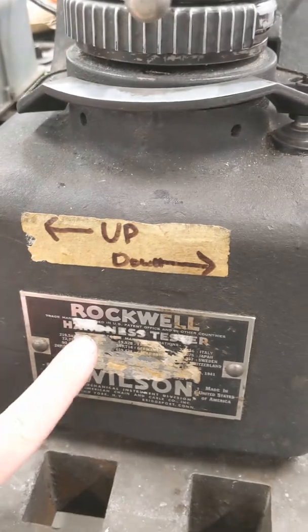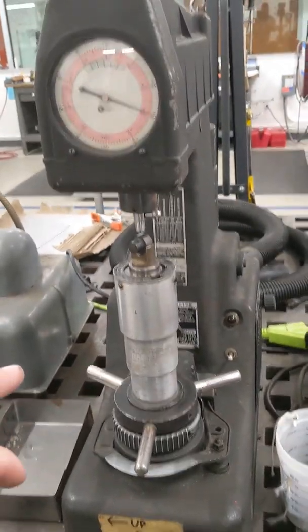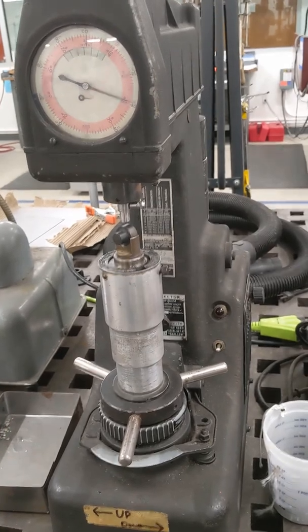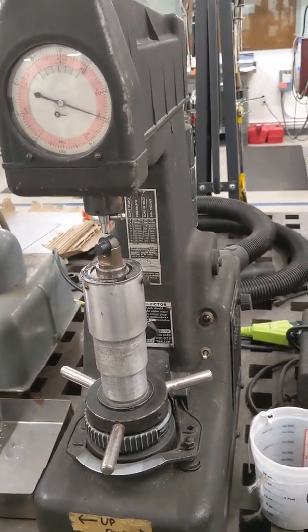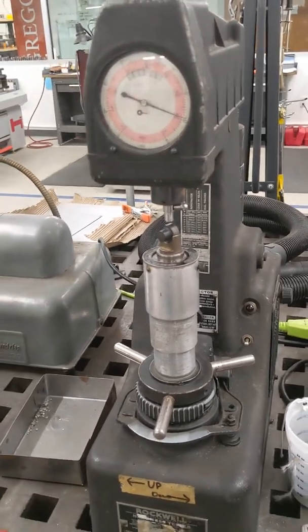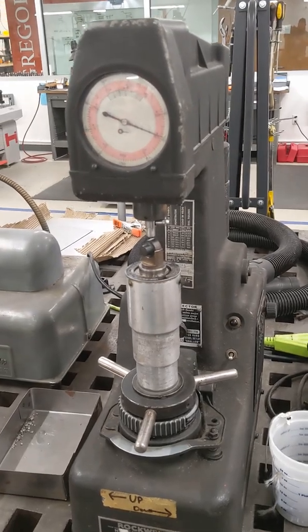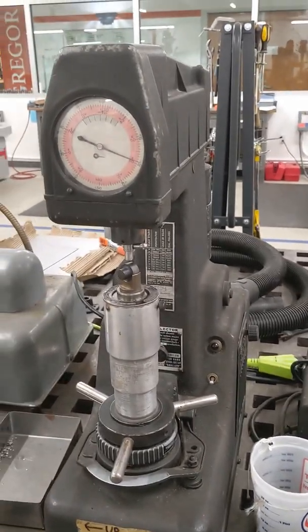This tester reads in the Rockwell scale, and it is set up to read in the Rockwell C scale, which is useful for measuring steels primarily. Steels fill the Rockwell C scale across their entire span, with soft steels at the bottom of the scale and hard steels at the top.